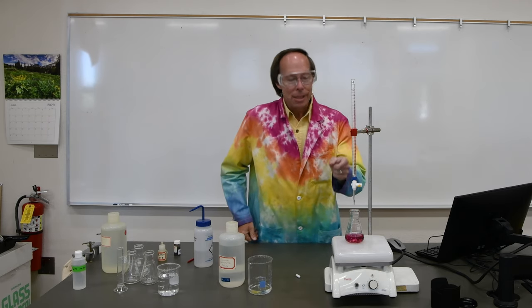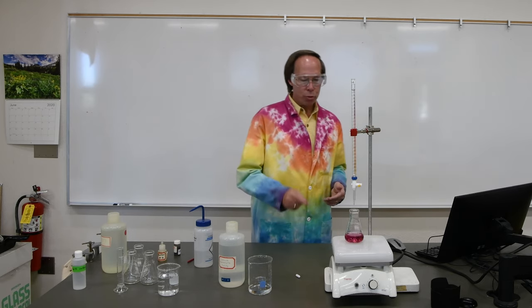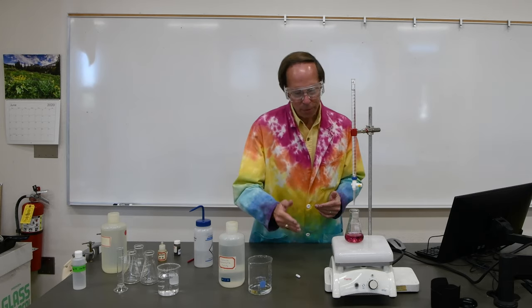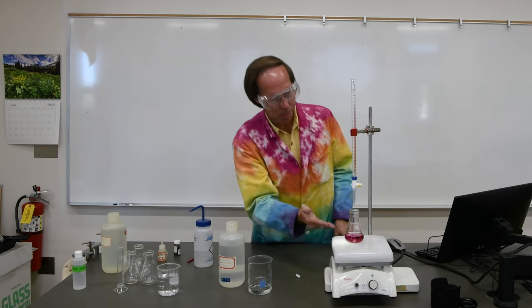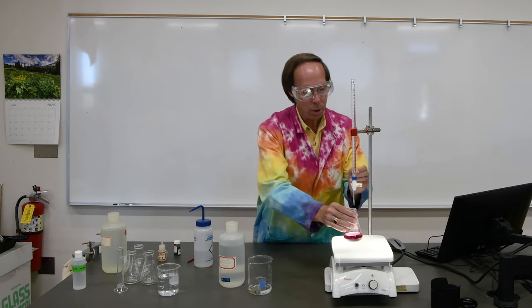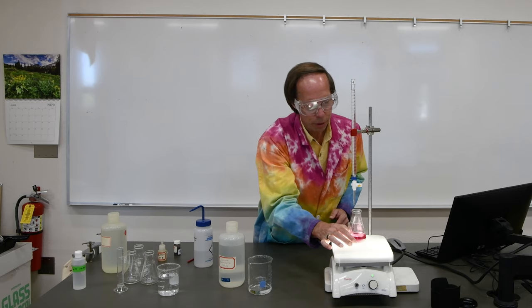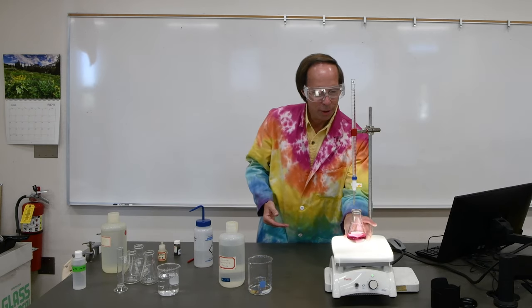Normally, as you're adding the EDTA solution, you would swirl the flask to make sure that the chemicals are mixing. This reaction has about a 2-second delay, so we have to add it slowly and watch carefully for that color change. To make it easier for us today, we have something called a lighted stirring plate. First of all, it has a light built in, which means it'll be much easier to see the color change. And it also has a magnetic stirrer inside, so I'm going to place a magnet inside my flask, turn that on, and now I won't have to actually swirl the flask because the magnet will do that for me. That magnet is in there spinning around now.